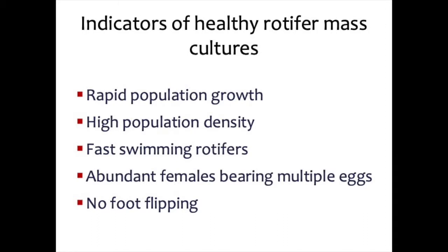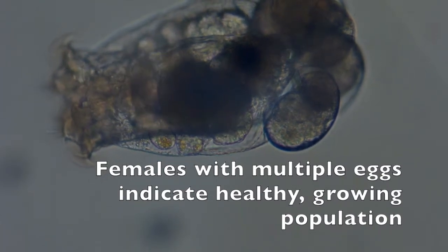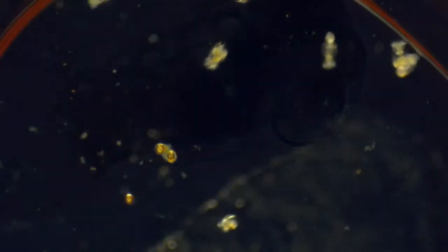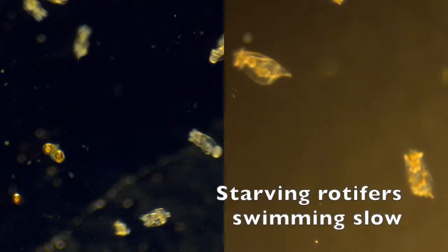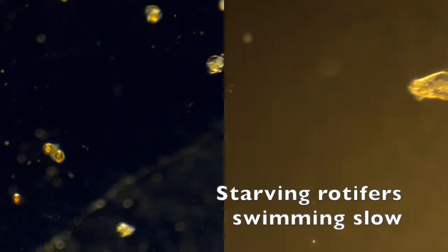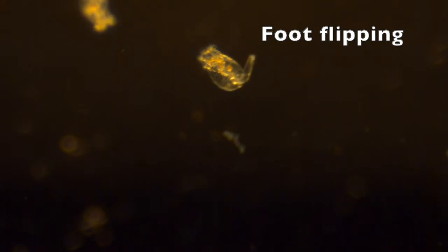It is good practice to check the health of the rotifer mass cultures daily. Indicators of healthy rotifer mass cultures include rapid population growth, high population density, fast swimming rotifers, abundant females with multiple eggs, and no foot flipping. A high proportion of females carrying multiple asexual eggs indicates a healthy growing population. Rotifer swimming speed is another indicator of mass culture health — fast swimming indicates healthy populations, while slow swimming indicates stress. A third indicator is foot flipping behavior; a high proportion of foot flipping rotifers signifies that rotifers are experiencing some kind of stress.